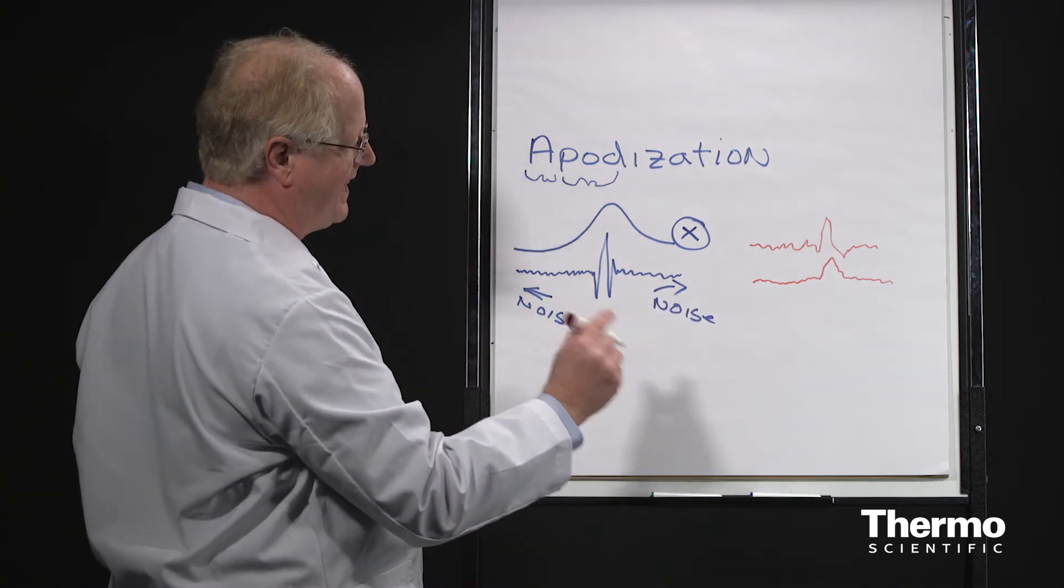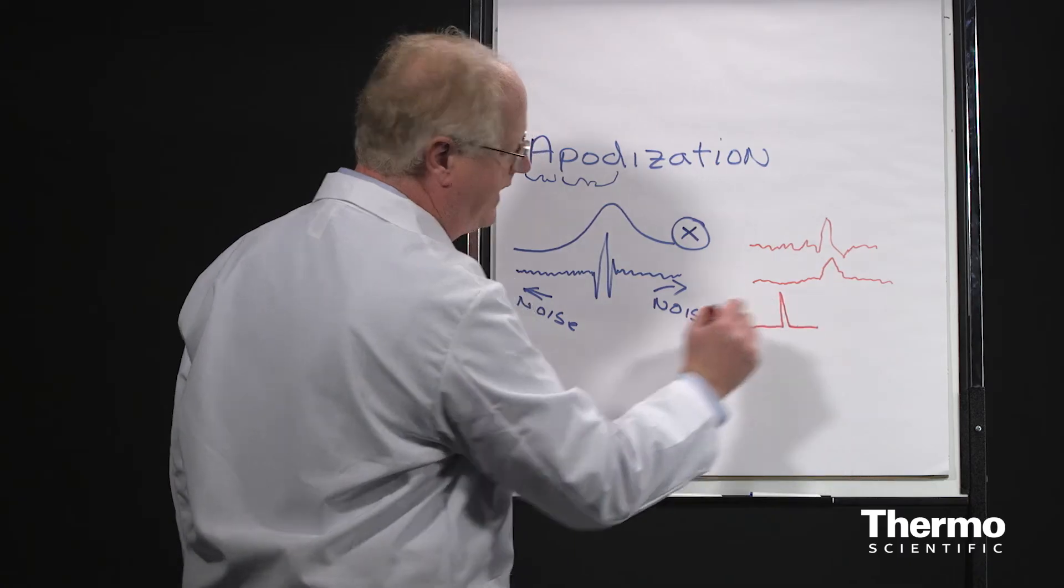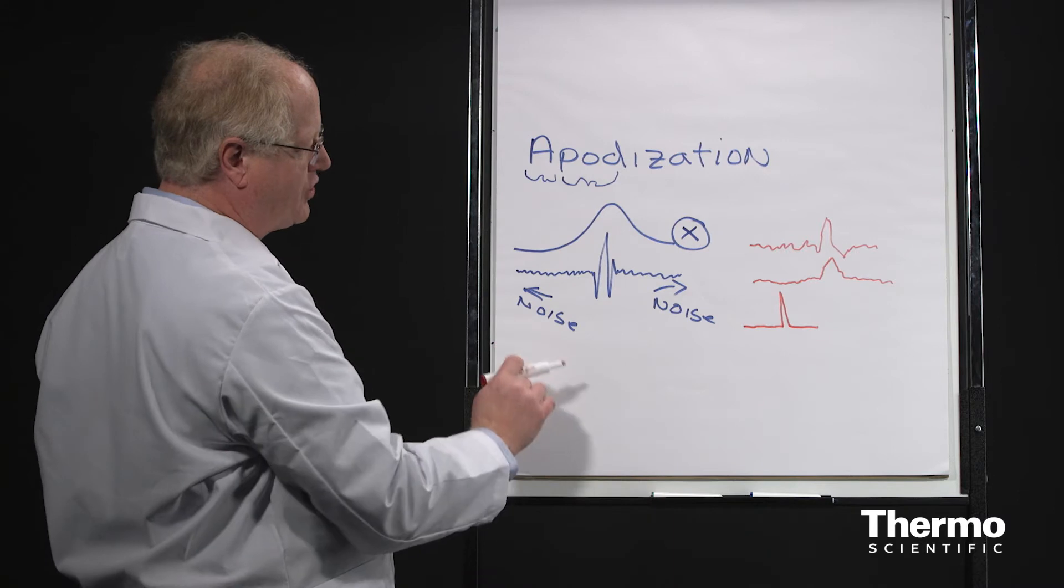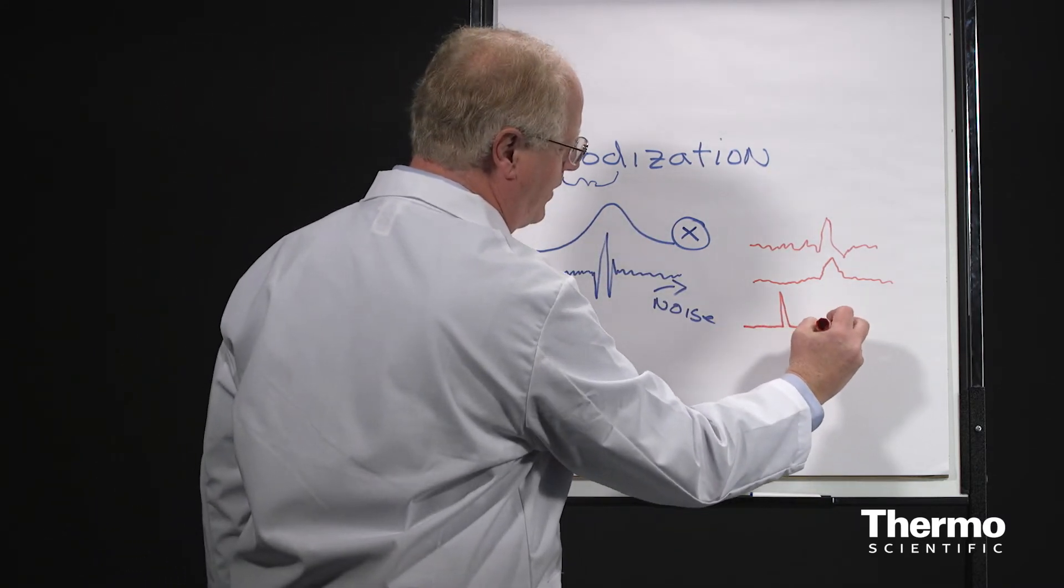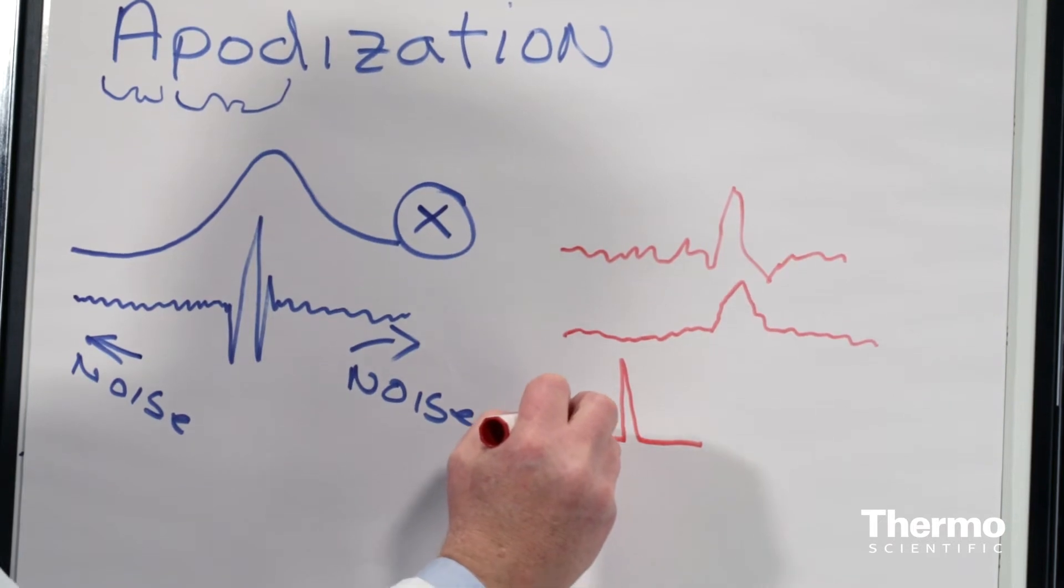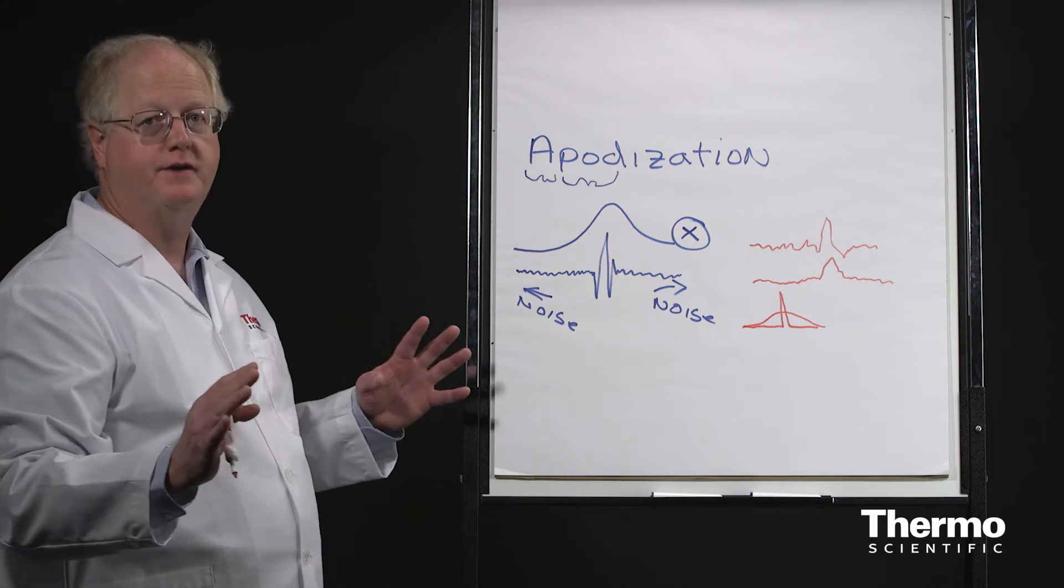We will run a gas phase spectrum where the peaks are very narrow. And if you apply a strong apodization function to a narrow peak like this, what happens is the peak looks like it's been run over. It flattens out and it actually broadens.